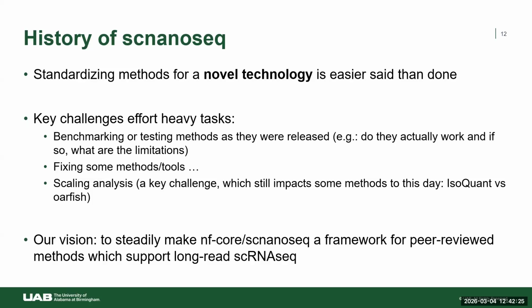We do try to provide users a set of sensible parameters that you can easily customize, but it is very hard for us as workflow developers to account for every single use case and need out there. So one thing you can do in Nextflow is write a custom configuration file that overwrites what we wrote without changing the source code and enable whatever parameter you want in that particular step.